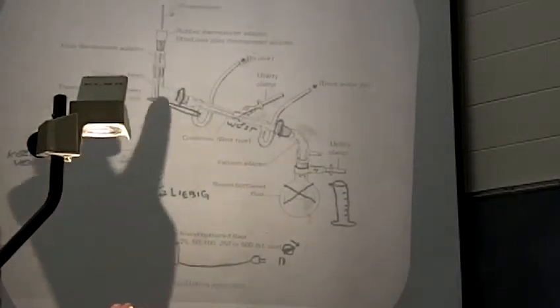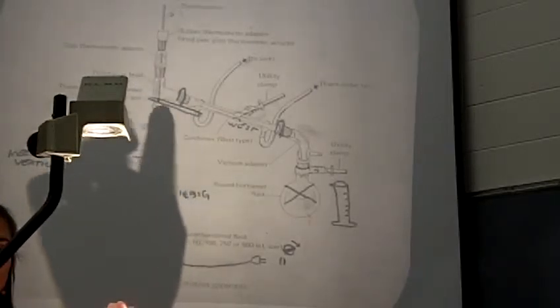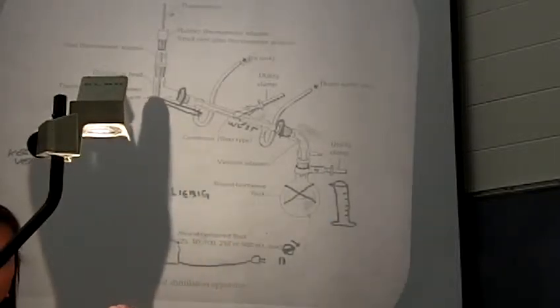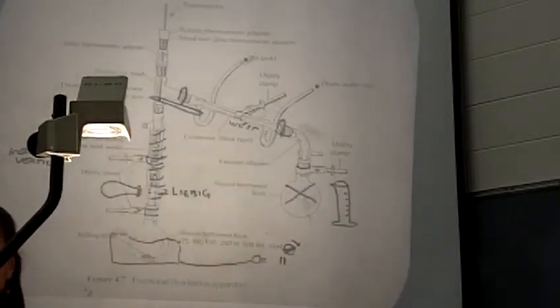Then you're going to put your three-way adapter and your thermometer. It is very important, your thermometer placement, okay? You will be determining what your unknown is based on its boiling point, and you need to be able to get a very good, very accurate boiling point range. So make sure the tip of that thermometer is just under the arm here of your three-way adapter, okay?